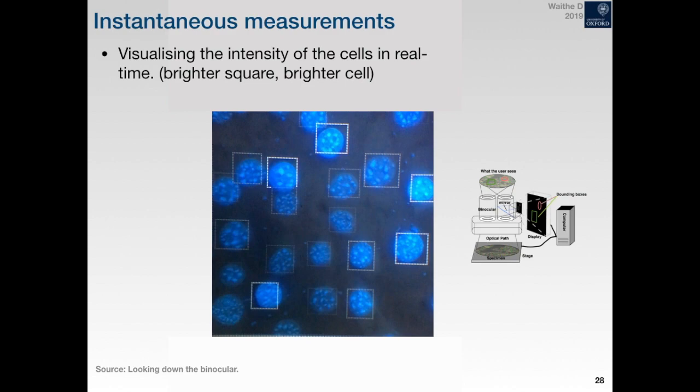Do you define limitations for features that would be deeper, in terms of shape or in terms of complexity of shape? Do I define the features? Yeah, I mean, to what extent would you say deep learning can learn to recognize features, depending on the feature itself, the complexity of it? Like if you ever thought about it or tested it.